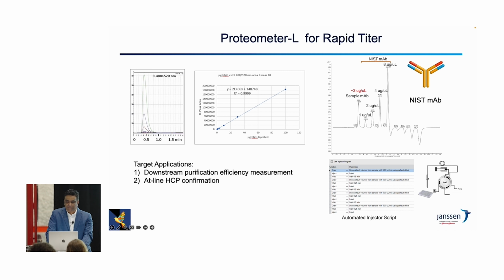So to the right of the last peak, the positive peak, we get these negative dips, which I alluded to earlier, becomes an issue when we have to monitor antibodies or do serial injections beyond that point in time. So how do we overcome this problem? Is we relied on column switching.